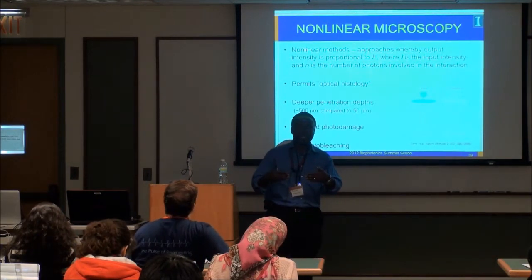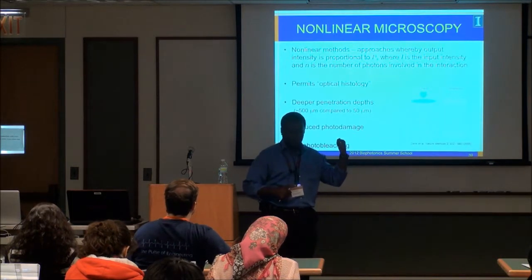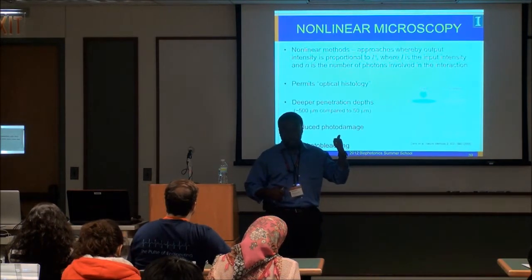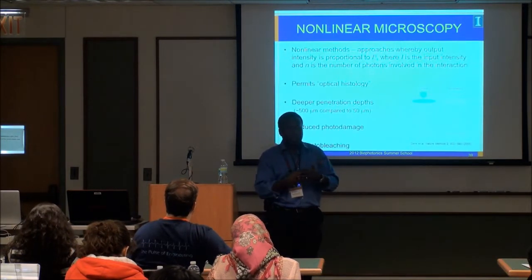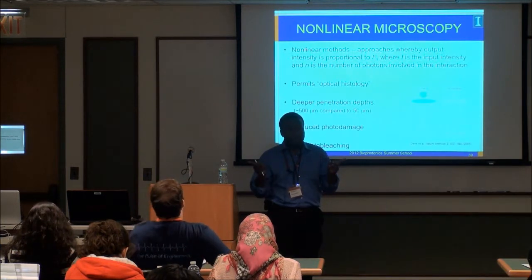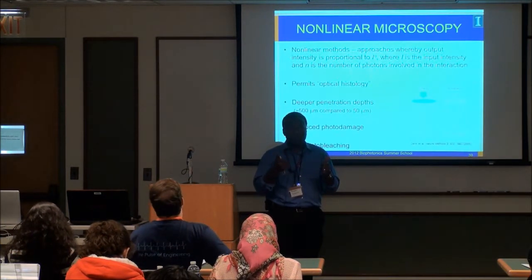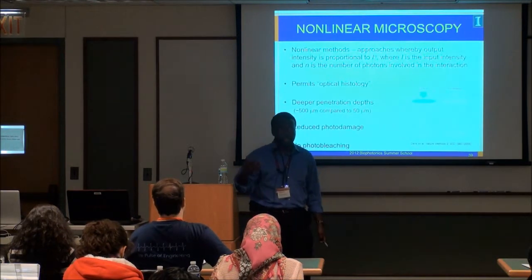One can ultimately ask, where's all this multi-photon microscopy going, right? The first two-photon laser system was invented by Webb and Zipfel back in the 80s. There are two areas. One is using techniques from quantum control, where people start doing pulse shaping. They use spatial light modulators.